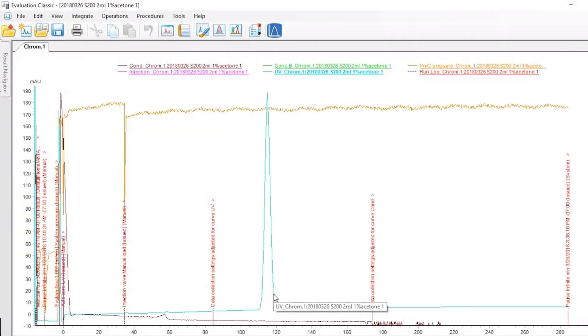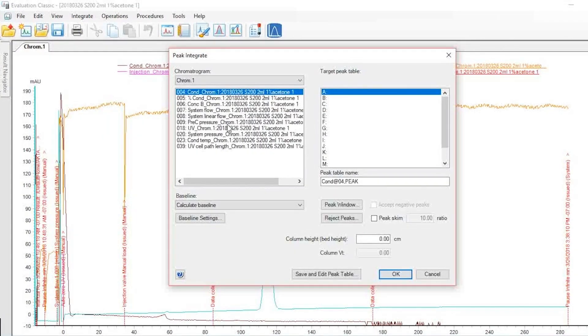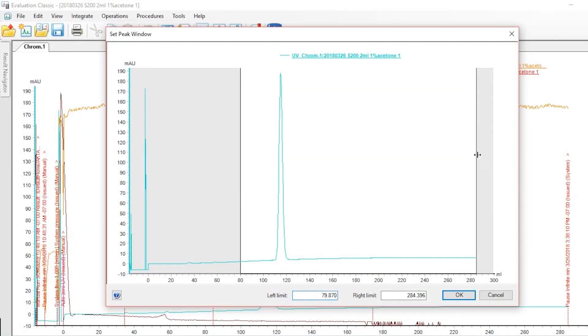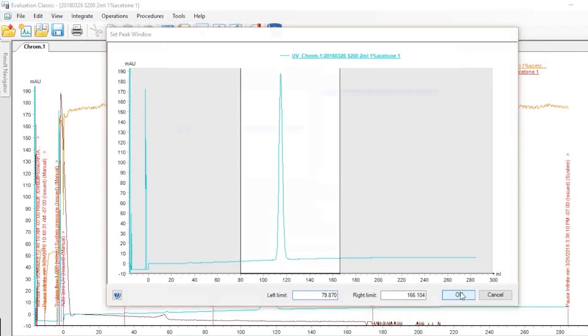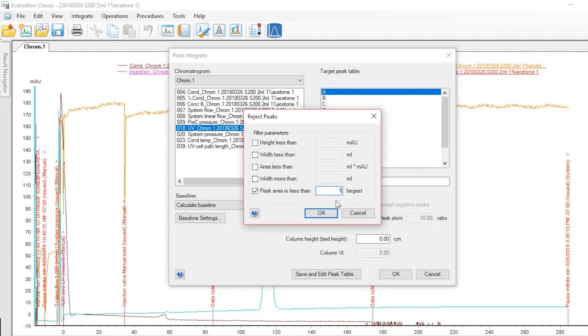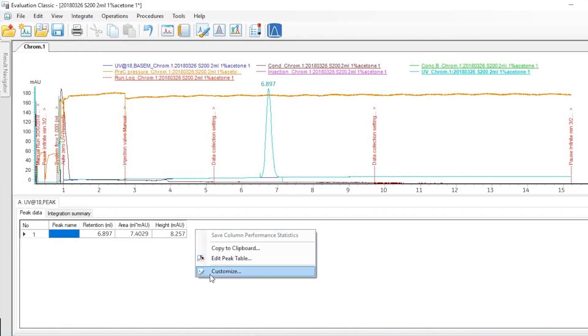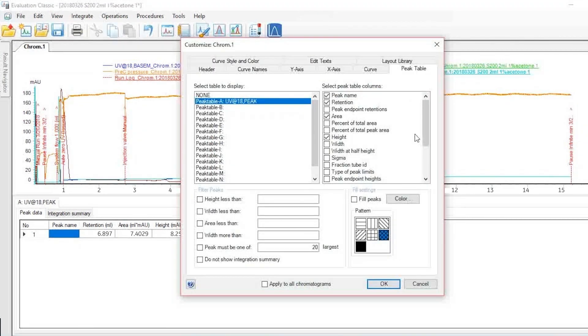Apply the sample and start the method. When this run ends, open the result and integrate the UV signal. Type in the bed height of the packed column. Click right in data table, select HETP and asymmetry. Here, you can find relevant values of column performance in the data table.